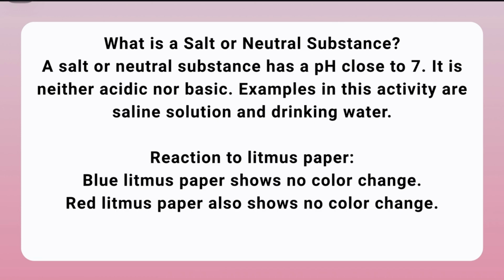Lastly, a salt or neutral substance. Its reaction to the litmus paper when it is blue, it shows no color change, and the same goes for red litmus paper. It also shows no color change.